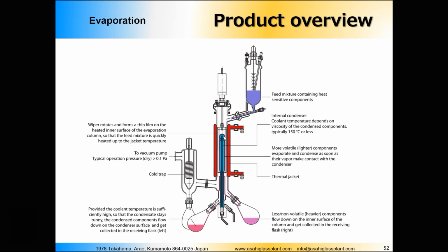And in this case, for the SPE, we do not have the disadvantage of evaporating till dry, because we do not need to evaporate till dry. We're trying to separate two liquid components here, and that's how the short path evaporator works.